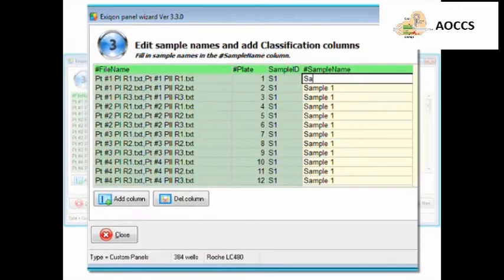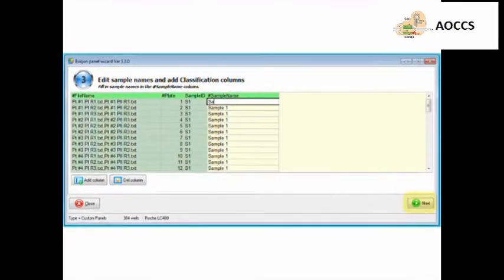The table generated after the file import contains predefined columns. Edit sample names, and add or remove classification columns at this step. Click Next when you're done, and save the data.